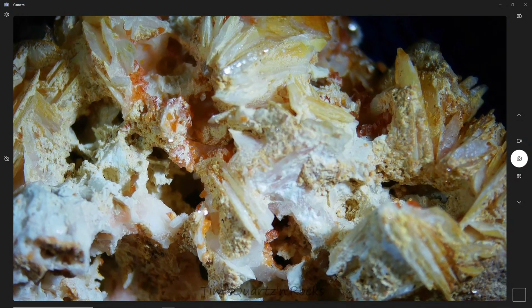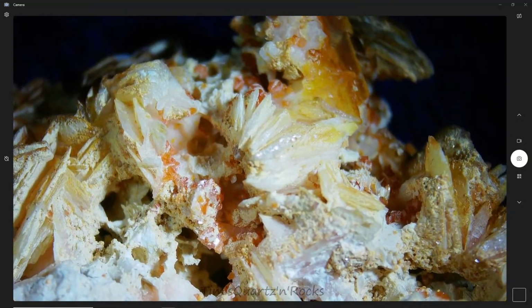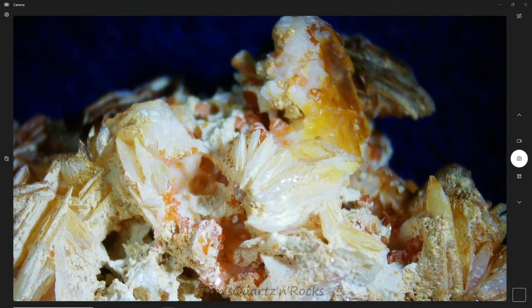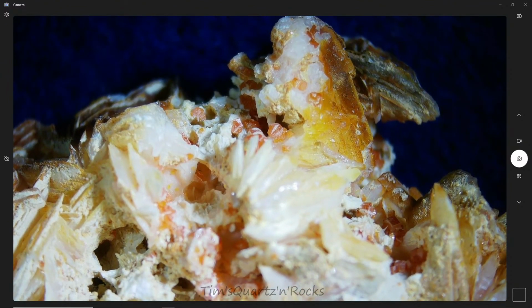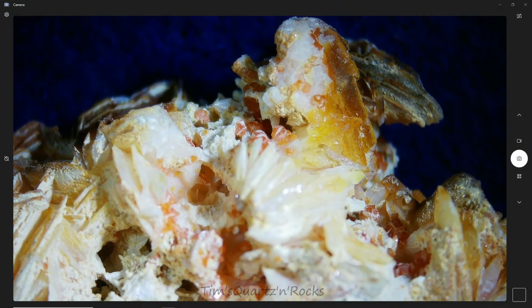So you can see all the crystals hiding out. And so what I will do is we kind of identify where all these intriguing points might be while looking in the zoomed out magnification. And then when we zoom in further, it'll make our job that much easier.